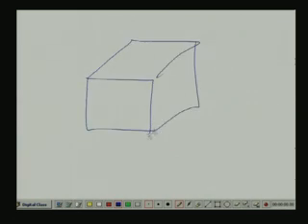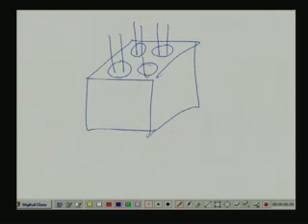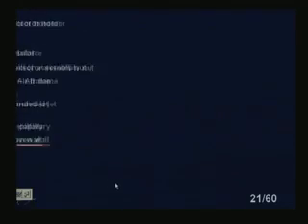So, what we have is a block. I can have 2 detectors and I can have 4 detectors also, like this one. Okay, let us go back.